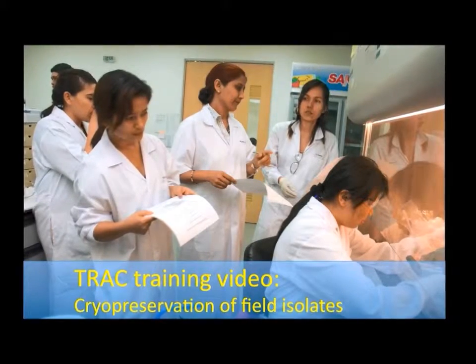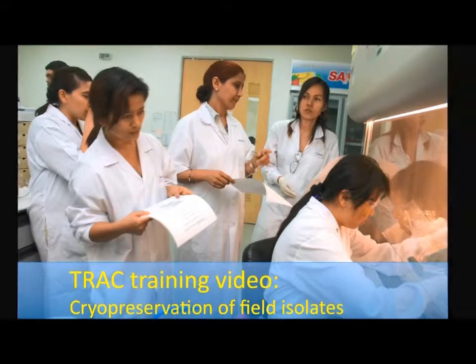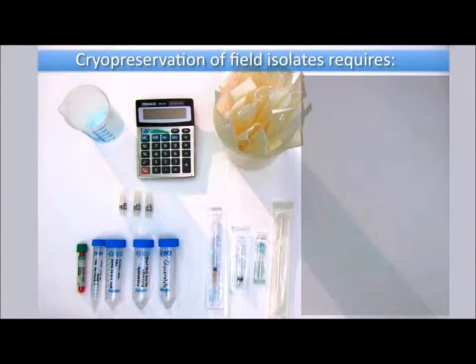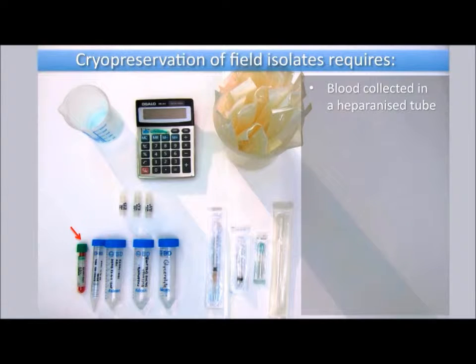This video will demonstrate the procedure for the cryopreservation of packed red cells. To perform this procedure you will need blood collected in a heparinized tube.